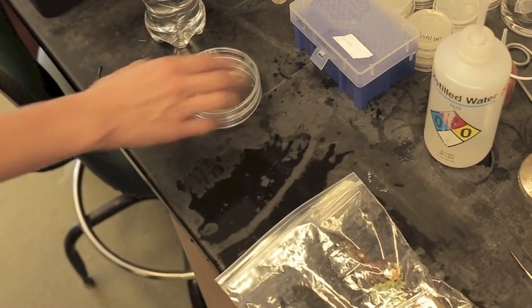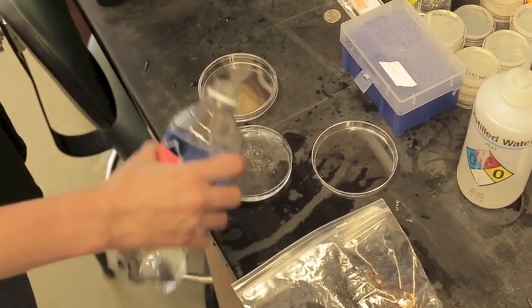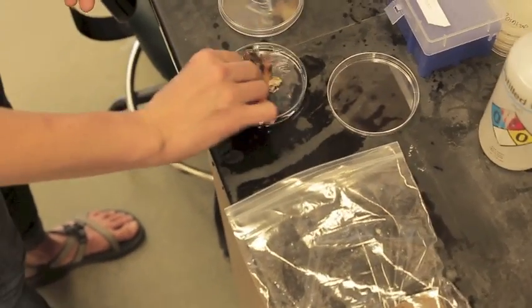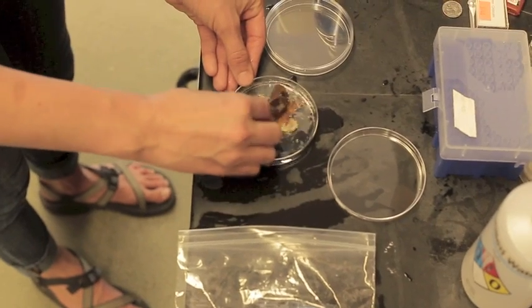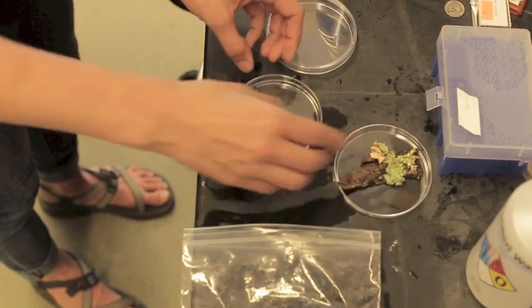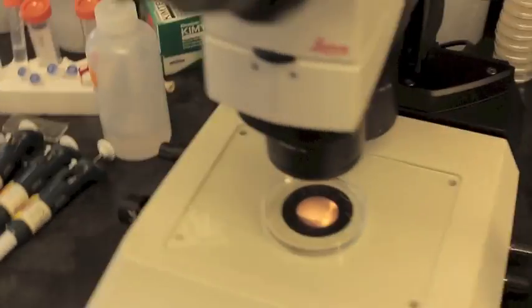Now that you've collected your samples, it's time to take them back to your microscope. First, start by taking a plastic dish and filling it with spring water. Then select one of your samples that doesn't have a lot of excess dirt on it, and shake it off in the water. This will help to dislodge any tardigrades in the sample. You can be pretty vigorous. Put your sample under the microscope, and now it's time to take a look and see what you've collected.